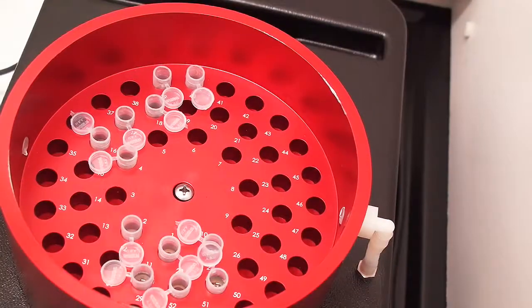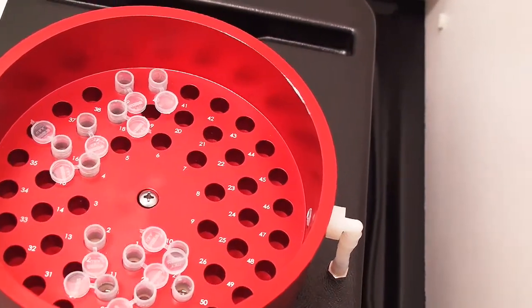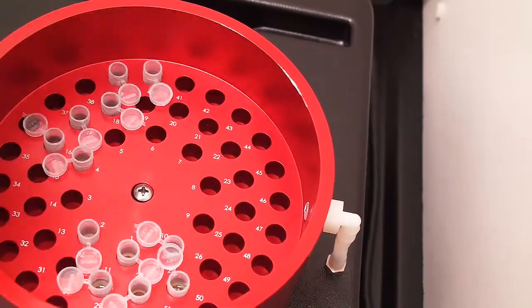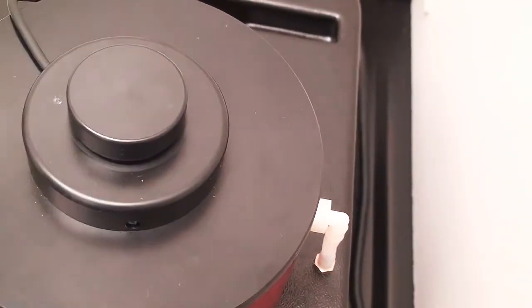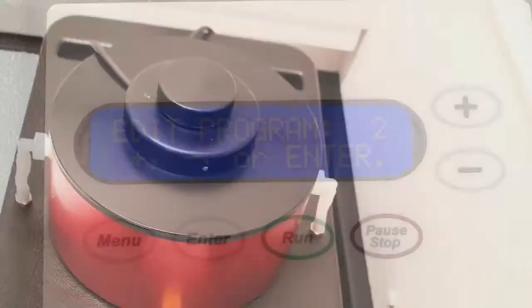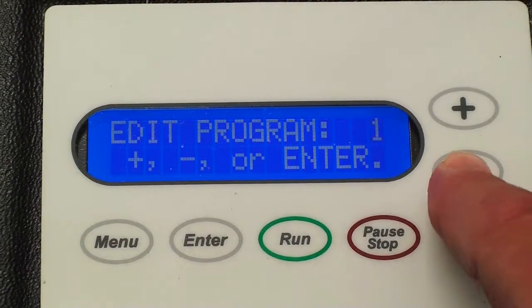I've loaded my acetonitrile and acetone infiltrated samples into the Poly-3. I'm going to put that on. And then we're going to take a look at the program that we're going to run. And this is fully programmable.